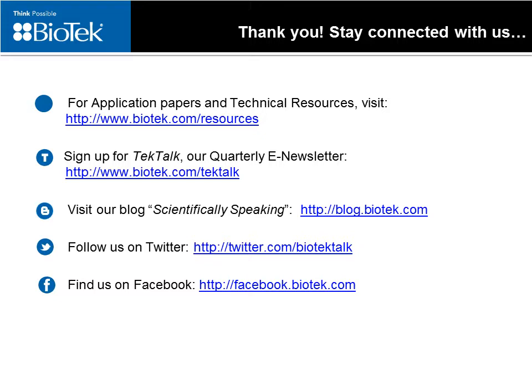So for the high contrast bright field imaging, there's a question about what is required for that. I covered this a little bit already, but it's really the high contrast bright field kit, and either the Lionheart FX or the Citation imagers can accommodate those kits. And that's really all you need to do this. That's the only specific component required, and everything else is just conventional or standard labware.